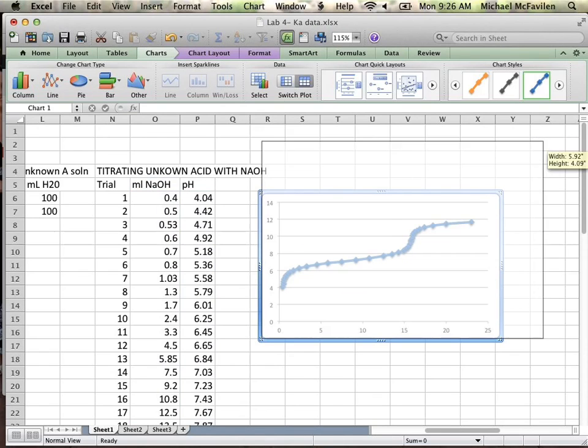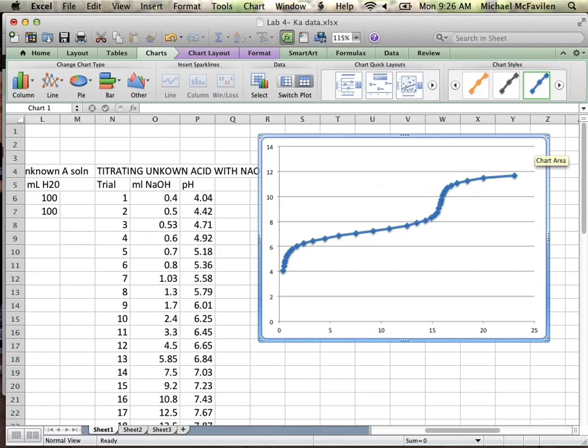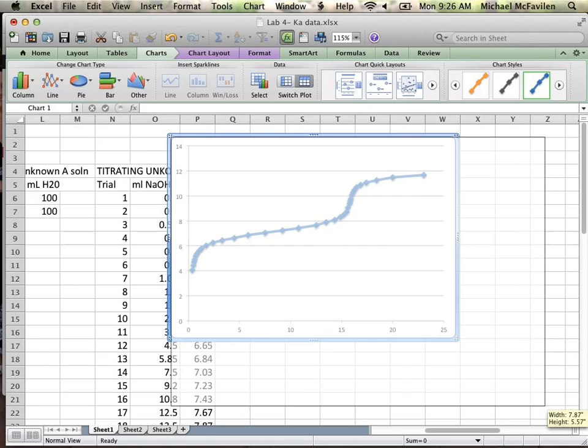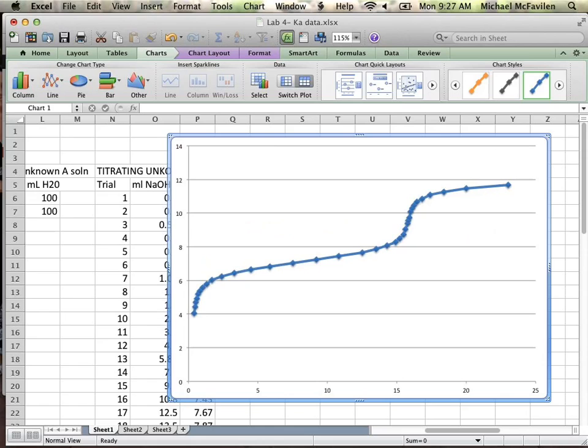So now what we'll do is make this a little bit bigger so we can see it a little bit cleaner. Some formatting tricks, particularly as it comes to reports. Every single graph needs to be fully explained. So in your report, at the bottom of this, you'd give it a little caption describing what it shows.